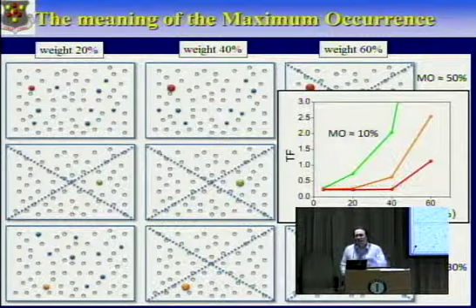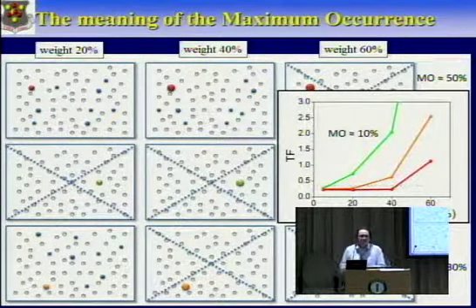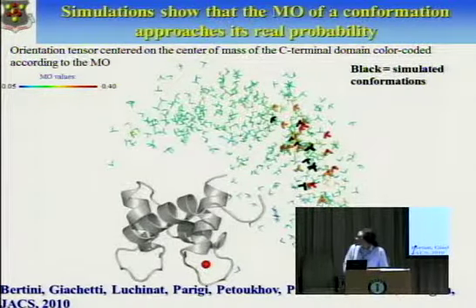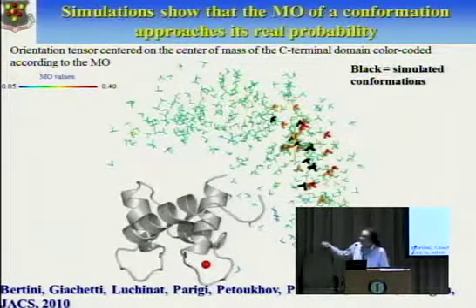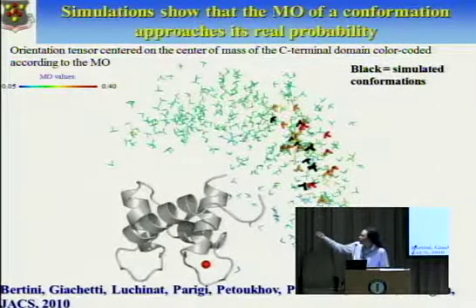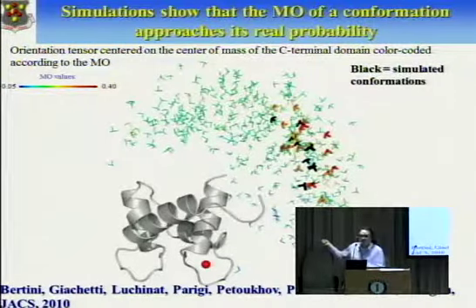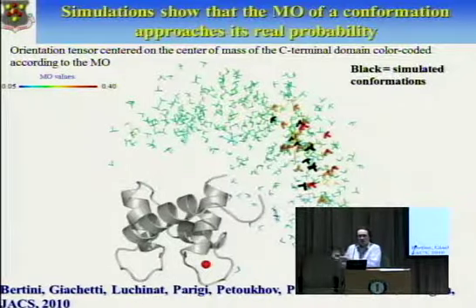It becomes useful. I don't know if I still have the example, I threw it away. If you have free calmodulin and then you bind the peptide to it, then you see that the space, of course, in principle is the same, because it's just driven by the linker length. But the heat map can change a lot, because now you are restricting the motions. So you get a narrower distribution and maybe more centered in a specific part of space.